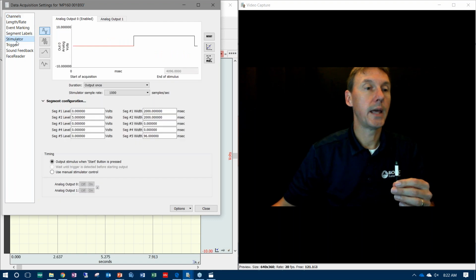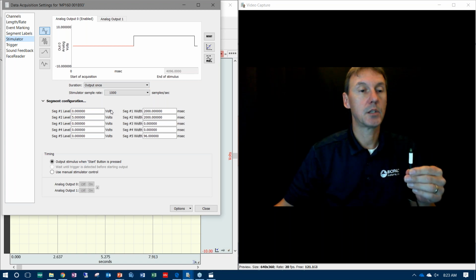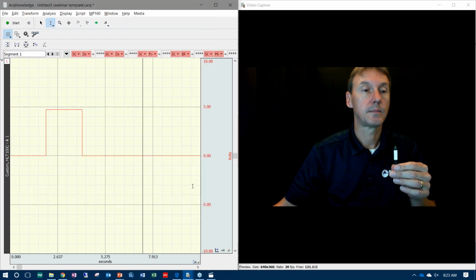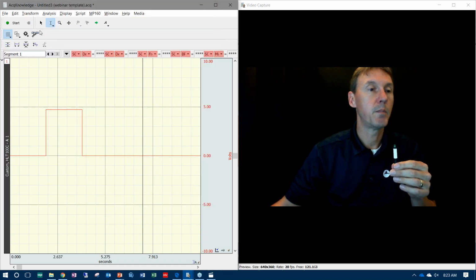If I come under stimulator, I can create a square wave output, and I'm outputting this once. So I've created a 2-second delay. So this first period here is 2000 milliseconds. And then I've got a 2-second pulse wave, 2000 milliseconds, set to 5 volts. And I'm just going to output that once right at the beginning when I start to record the physiological data. So if we close out of here, I'm going to set this back.